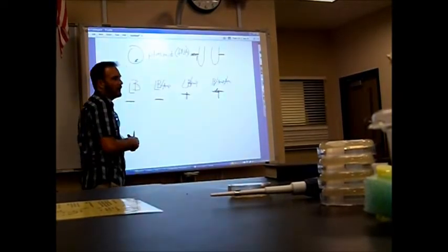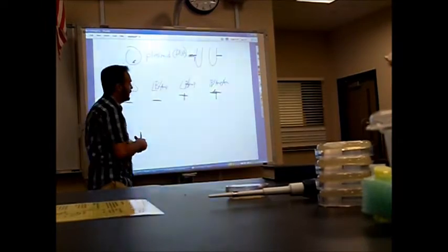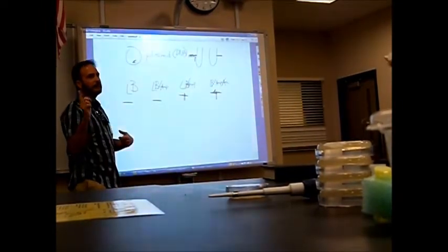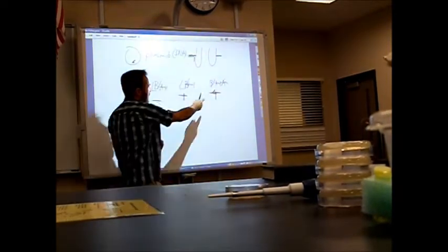Do you think these guys will glow? No. They shouldn't glow. Why won't they glow? They have the DNA that tells them how to glow. They don't have the sugar. They don't have the sugar that flips the switch turns the switch on.